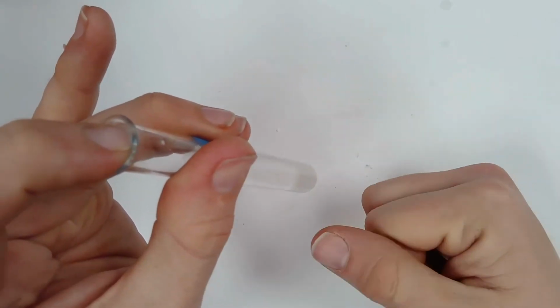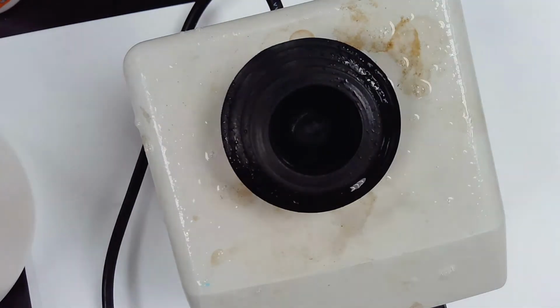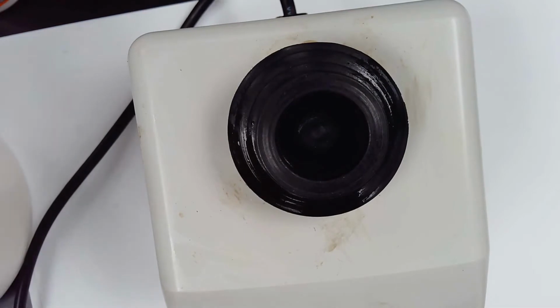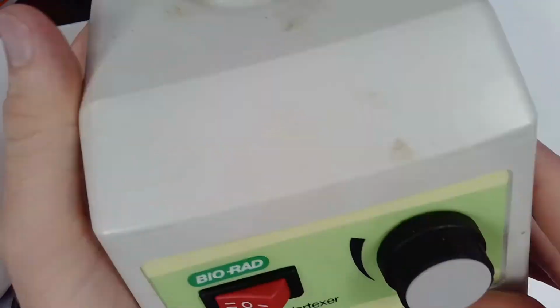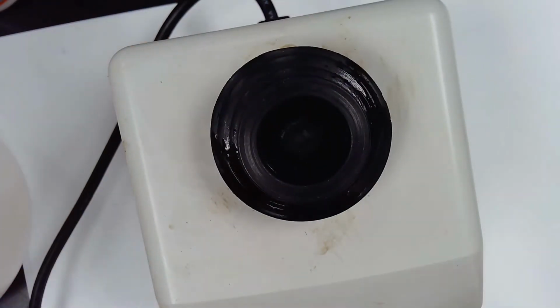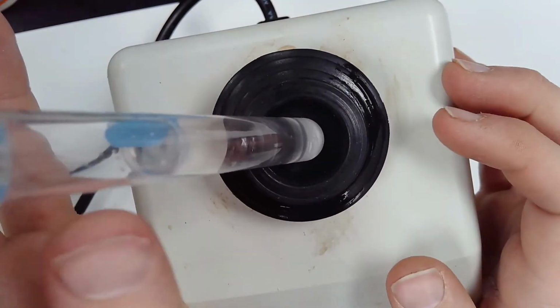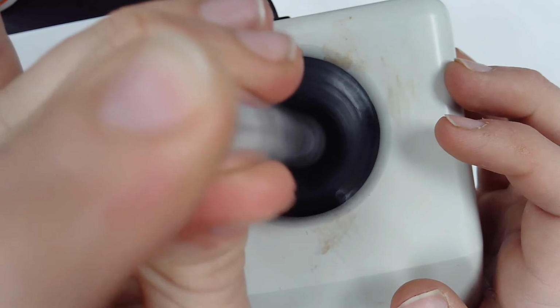So actually, I have an idea. All right, perfect. So this thing is called a vortexer, and it's just a little motor with a dial on the front and this little rubber thing on the top, right? And what's cool about this is if I set it upright, I take my test tube here and I just push down on it. Hey, it shakes things, right? But what's really nice about that is I don't have to sit here and flick it or shake it or whatever, and it's just stirring.